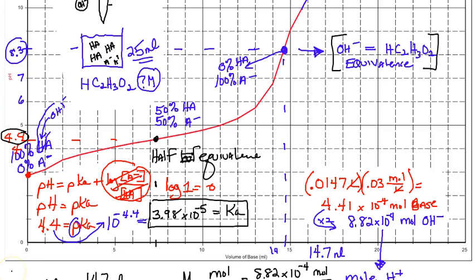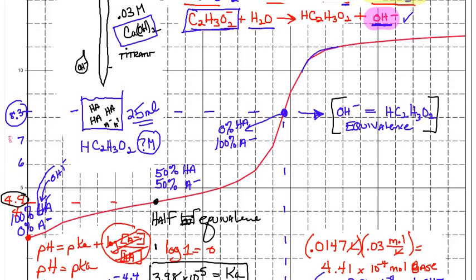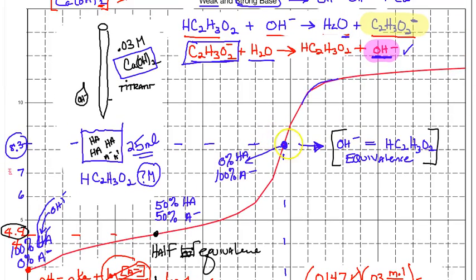All right? And we have the concentration, the equivalence point, now the end point of this titration, since we used phenolphthalein, would be somewhere in this region. We don't know for sure, but the end point for phenolphthalein, so let's just write it, the end point. Now we do know in a table of pKa's for phenolphthalein, it's about 9-ish.